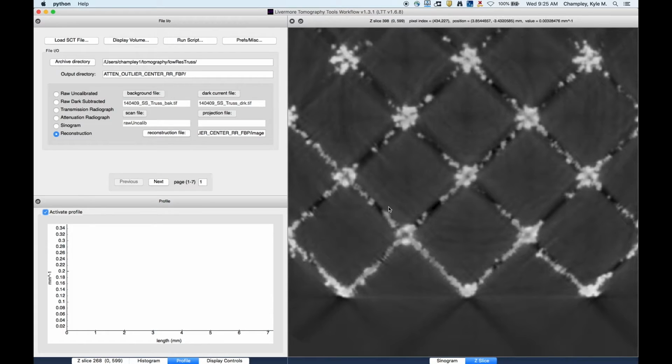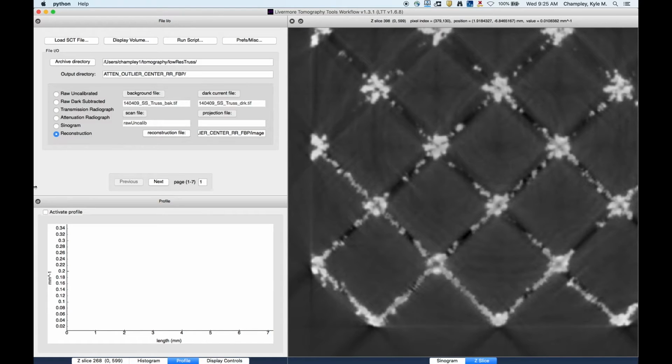And as you can see, only one thing is activated at a time. You can only either draw a line or a square, or if none of them are activated, that's when you can click and draw, you can pan. But anyway, let's see what else we can do with these.